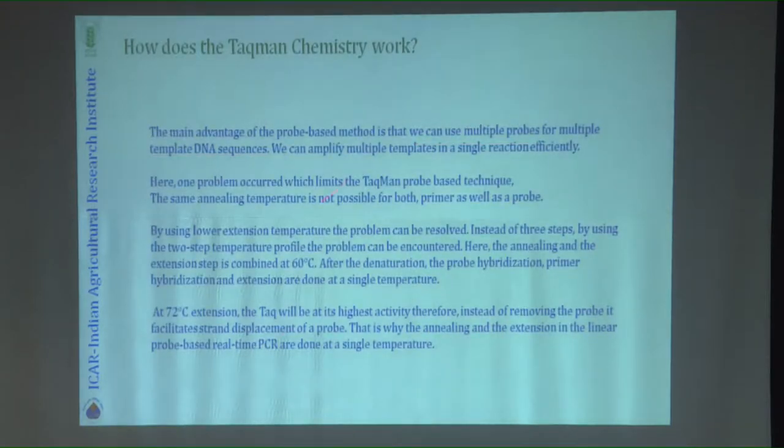The main advantage of the probe-based method is that we can use multiple probes for multiple template DNA sequences. We can amplify multiple templates in a single reaction efficiently. In the earlier case, we were able to amplify only one type of template. Here we can use multiple because you can select different probes with different fluorophores and quenchers.